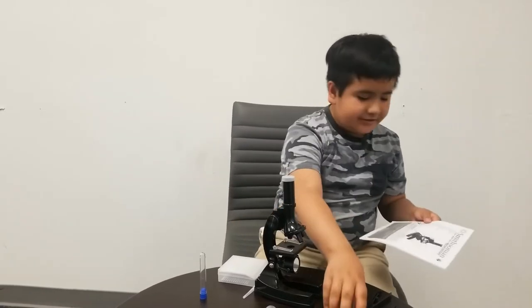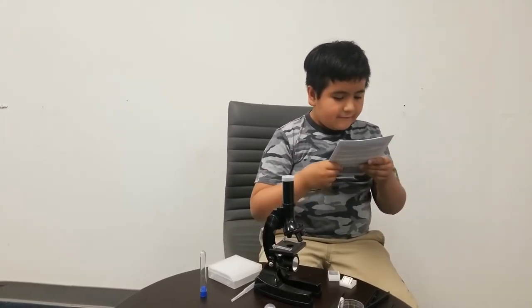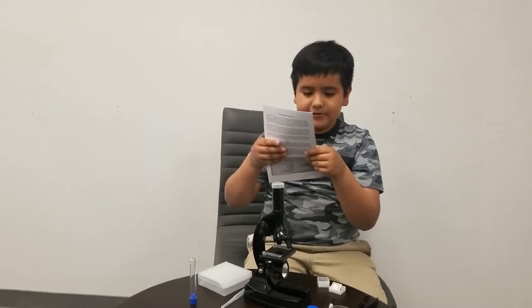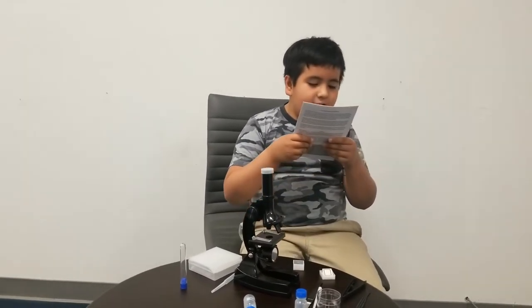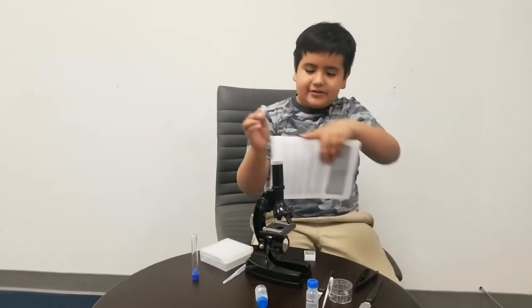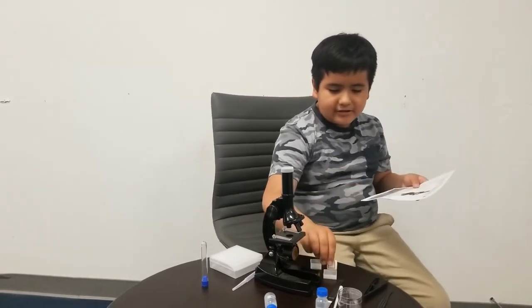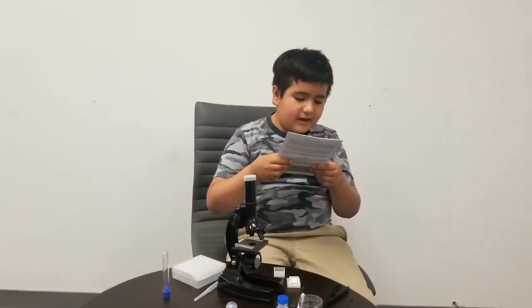A petri dish — I think this is what that is. And then there is the pipette — I think this is a pipette. Specimen vials — that's what it says on this. And two specimen vials, three prepared slides — I think these are the plastic things that we dropped earlier. Blank slides — I think that's also that. One storage case for the slides — I think this is it. Eight slide labels, and eight slide covers.